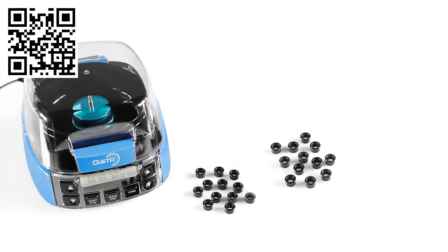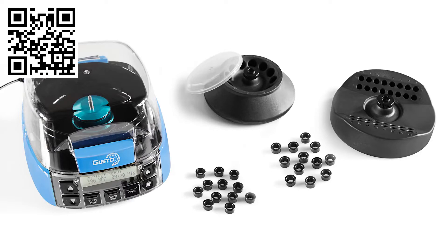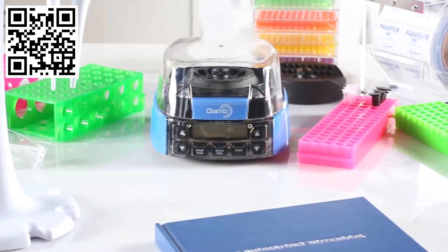Included with the Gusto high-speed mini centrifuge are 12 × 0.2 milliliter tube adapters, 12 × 0.5 milliliter tube adapters, a 12-place 1.5 to 2 milliliter tube rotor with a rotor cap, and a 32-place 0.2 milliliter tube rotor available in singles or 4-by-8 strip. The Gusto high-speed mini centrifuge: huge capabilities, tiny footprint.